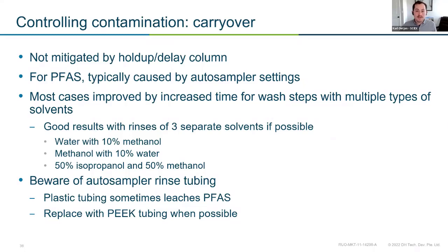If you're running into these issues, one of the things I like to do is increase the rinsing. You can rinse with IPA and 50% methanol, or even adding a little bit of formic acid to your methanol usually makes a pretty big difference.